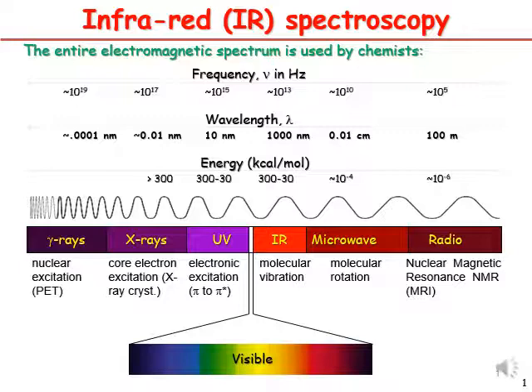Today you're going to learn about infrared spectroscopy, and I believe that most of you already understand the electromagnetic spectrum, which I already explained in the previous chapters. So I hope that you can implement the same concept in this topic. Okay, so I will not explain more about the relationship between frequency and wavelength, or wavelength and energy. I will not explain again.